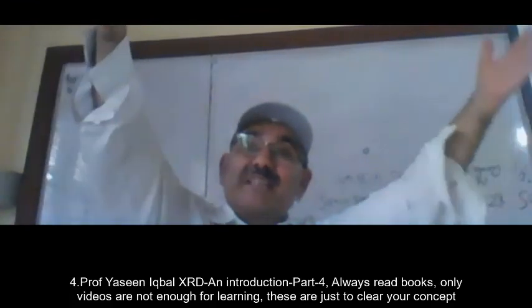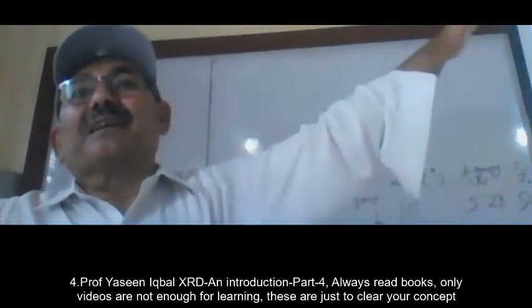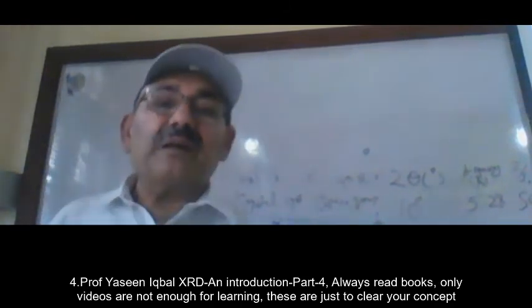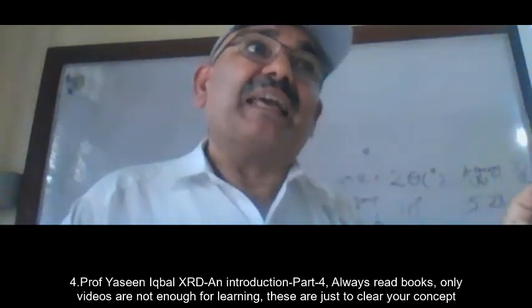You are modeling basically this room as a small unit cell, but you can't go inside the unit cell, so you expand it and take its reciprocals. So the smaller becomes larger and the larger becomes smaller. Here you distinguish between spaces, right? So when you go closer to 0 degree, you are increasing the interplanar spacing, and for large crystals, you use small angle X-ray scattering.